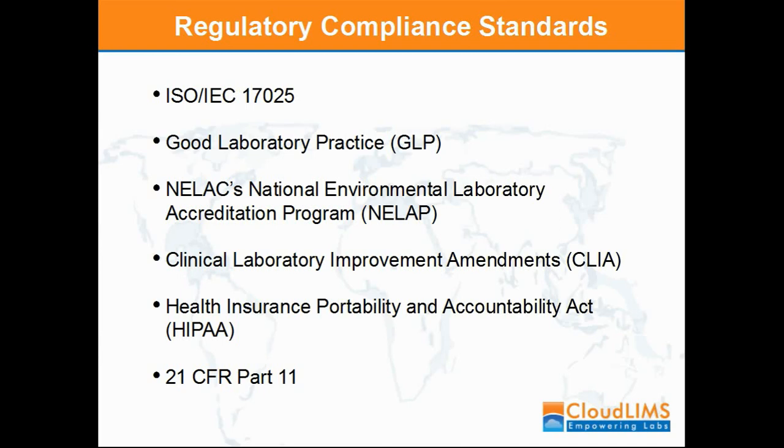In the United States, the HIPAA governs the privacy and protection of medical information and health records. The LIMS has the capability to address major security elements such as preventing unauthorized access and alteration to patients' medical records. The LIMS can electronically mask the data from unauthorized access and allow data to authorized individuals.